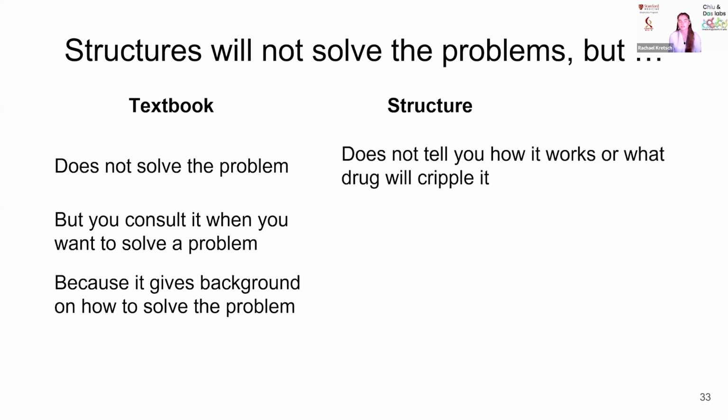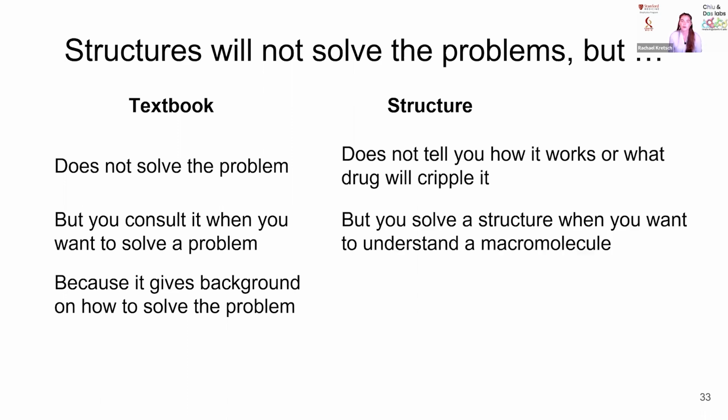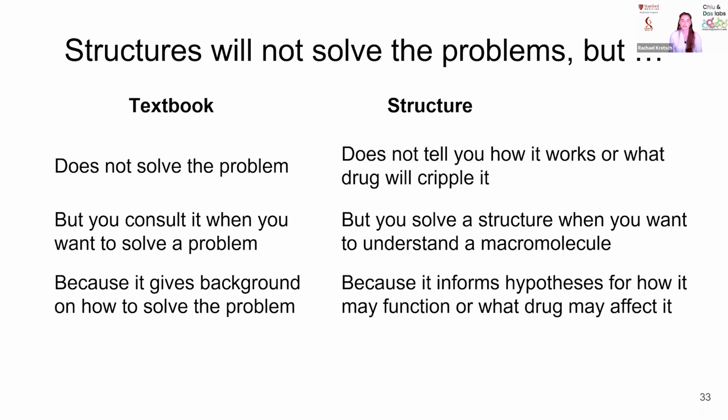Structures are very similar to biology. They will not tell you how the macromolecule works or what drug will stop it working, but you still solve a structure when you want to understand the biology because it forms your hypotheses on how it may function and what drug may affect it.